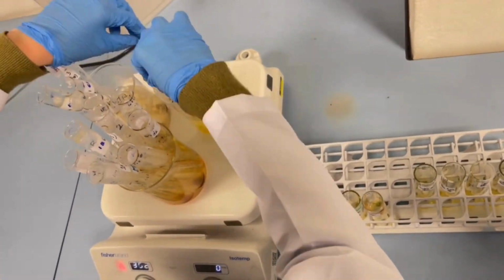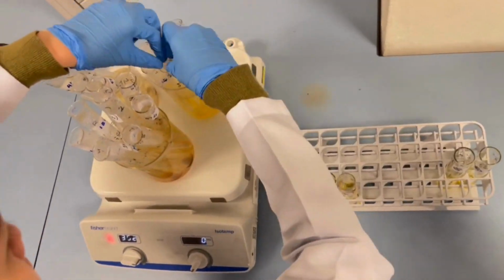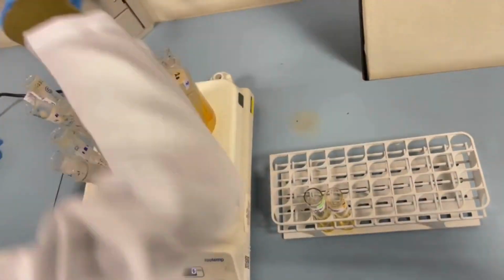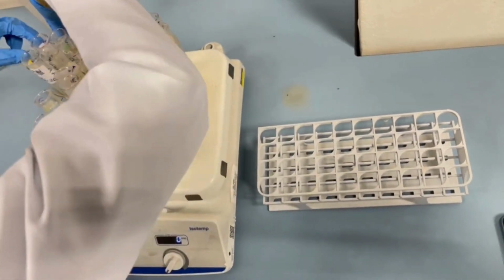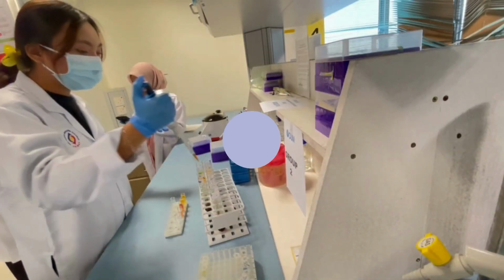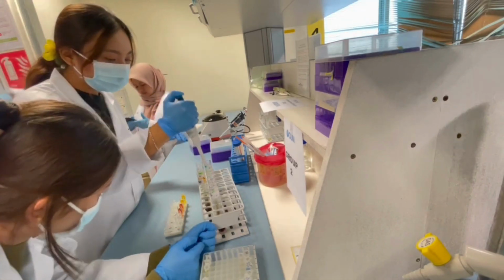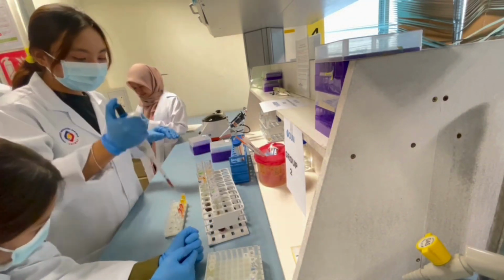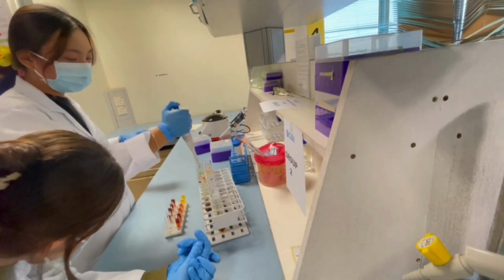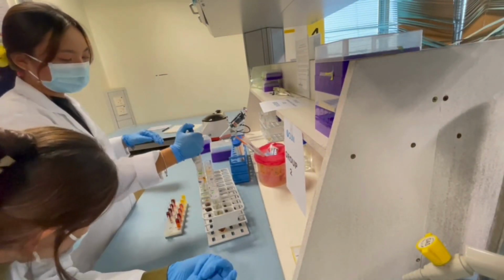Next, the test tubes are boiled in a hot water bath for 5 to 7 minutes. This step will help to increase the rate of reaction between the DNS reagent and reducing sugar. Then, after the test tubes are cooled, 1 ml of Rochelle salt is added.